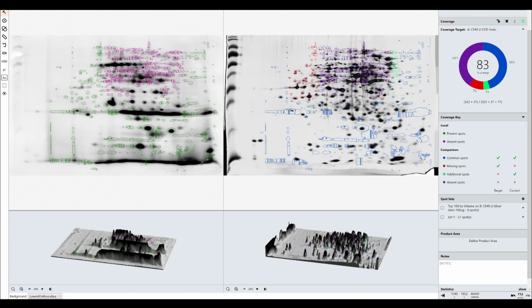And of course, if you're doing bridging studies or you've defrosted the extra aliquot of antibody and you want to compare it to the antibody you've been using previously, doing things like quadrant analysis is a really good way of doing that. I might make a separate video on bridging assays because they are quite complex, but certainly quadrant analysis is a really good way of characterizing one antibody versus another to see that yes, you might have the same coverage, but where is that coverage located?